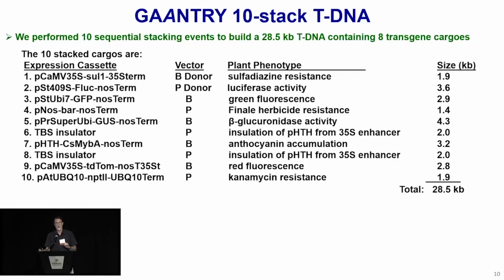For one thing, it'll make a repetitive sequence in your assembly that could affect the stability of the construct, as well as induce silencing, and then you get silencing of all those traits if it's transgene silencing based on that promoter sequence. So using a different promoter and different control sequences, terminators, to express your genes of interest is an important attribute to think about.